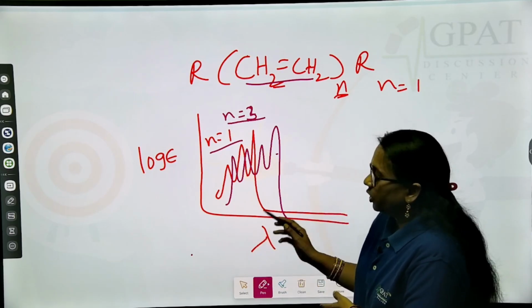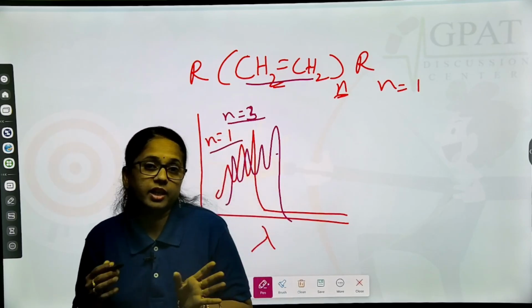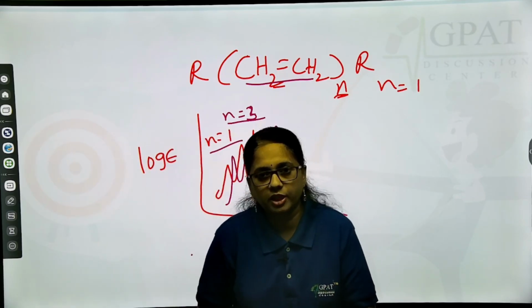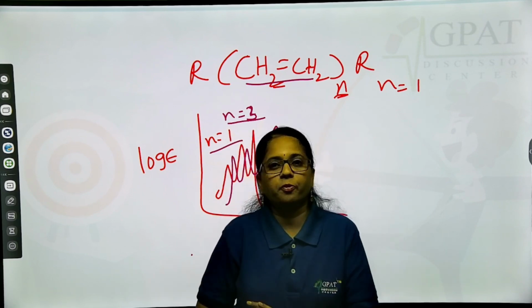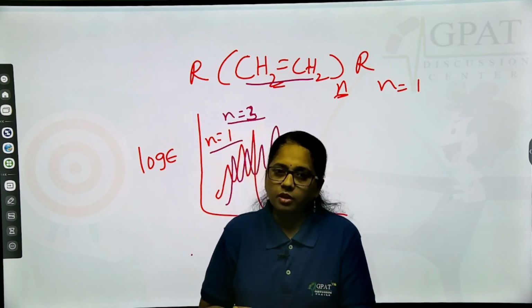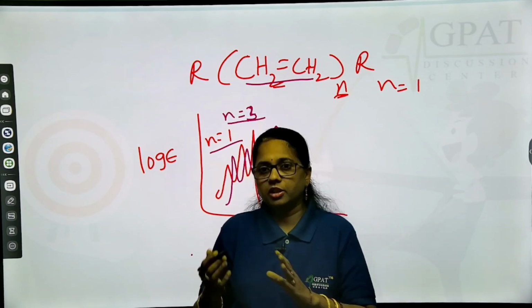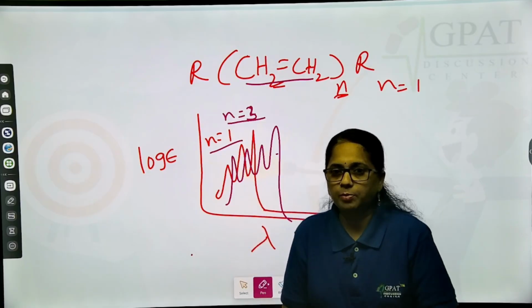In that way you will come to know, in kinetic reactions also, whether the complete conjugation has been done and whether the final product has been formed from the intermediate or not in synthetic reactions. So all these reaction kinetics will also give you some information.